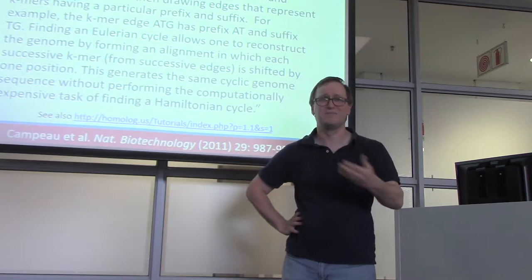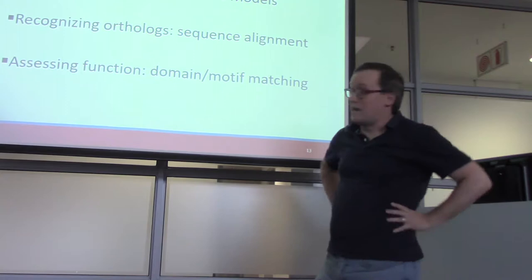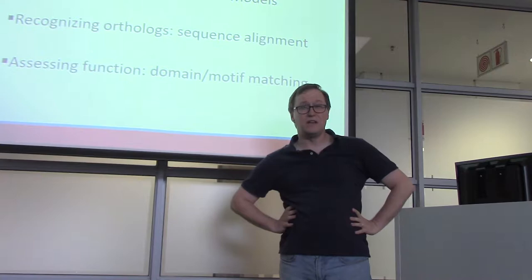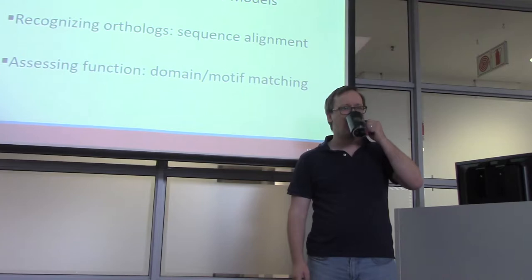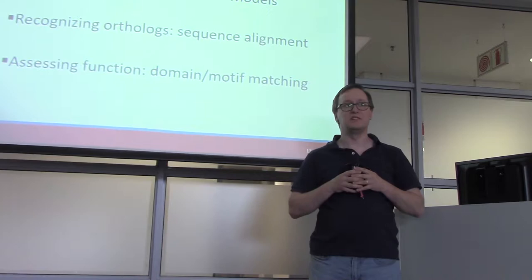Okay, now, we have started with a bunch of sequencer reads, we've made some judgments about them, and now we've built an assembly from them. So, how is one long piece of DNA different from an annotated genome? Is an annotated genome just a long DNA sequence?